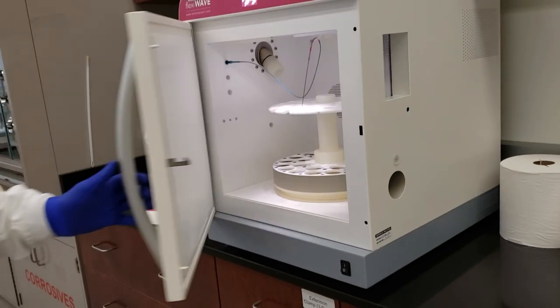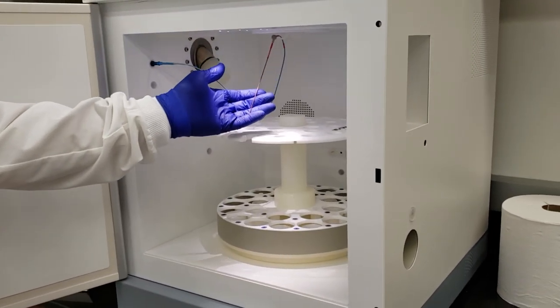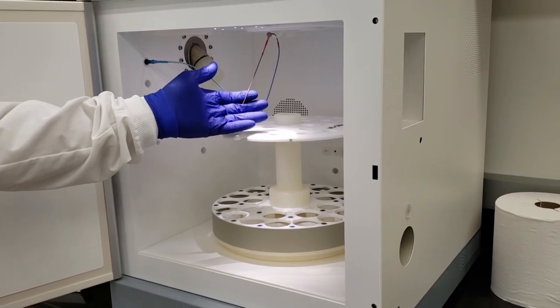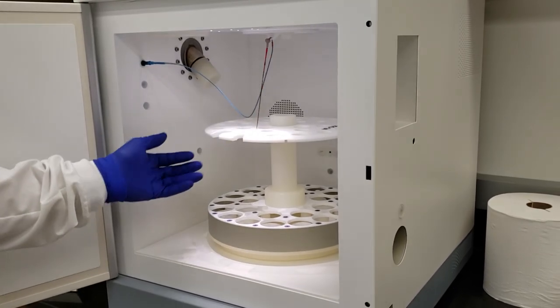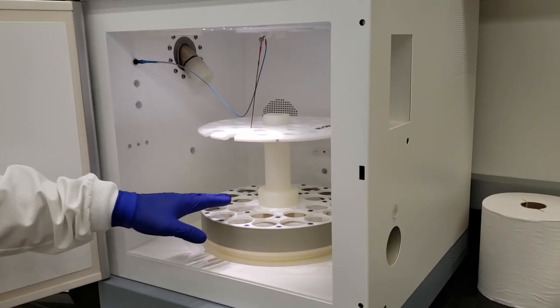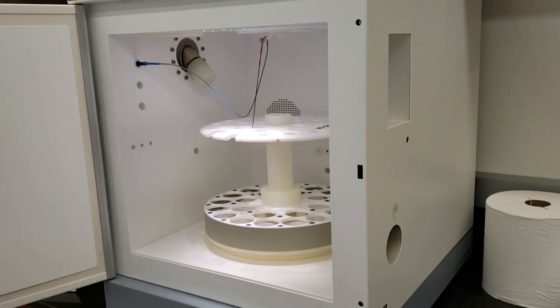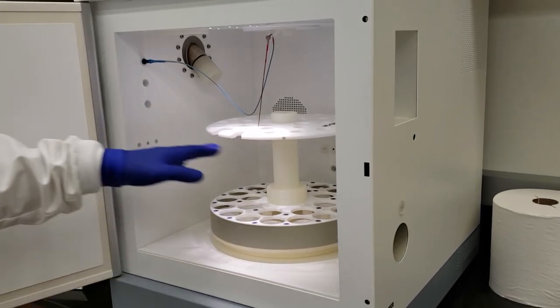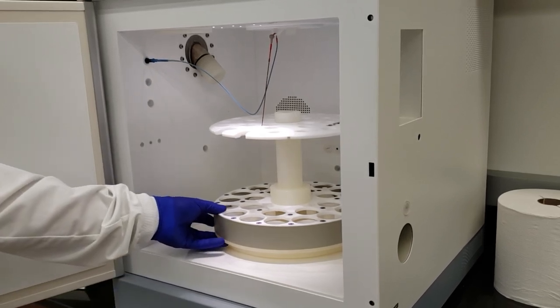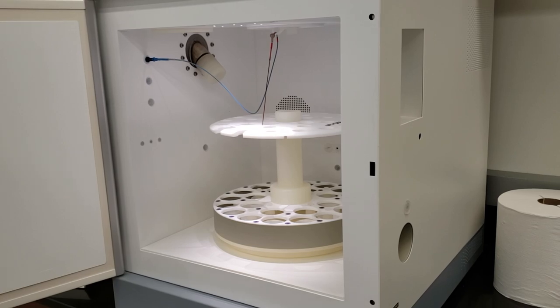We'll take a look at the interior of the unit. We have our temperature probe. This is a fiber optic temperature probe that's going to be inserted down into the reaction vessel so we can monitor the temperature. We have our rotor here. There are 24 spaces on here that we can use for 24 individual reactions. Today we're just going to be using one, but we have the possibility of running multiple experiments at the same time. This rotates through the interior cavity as the microwaves are heating the solution.